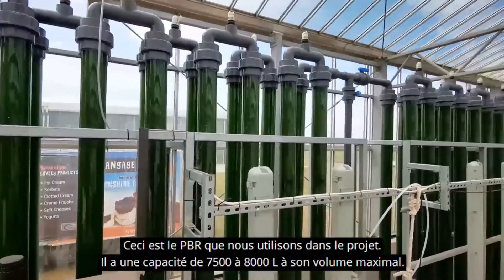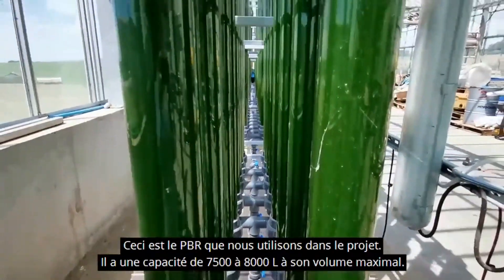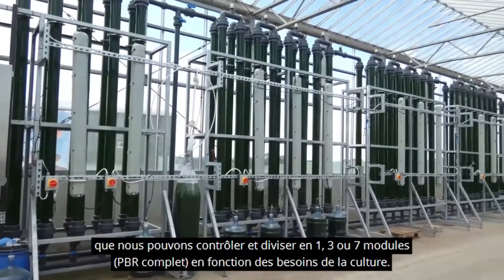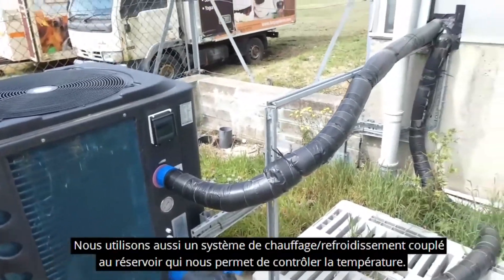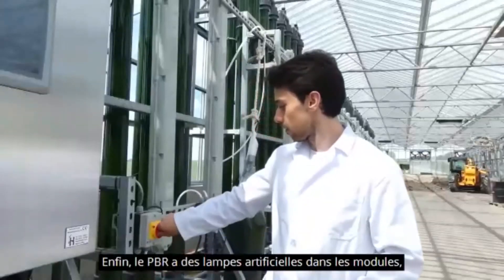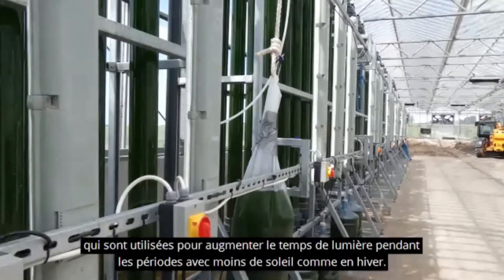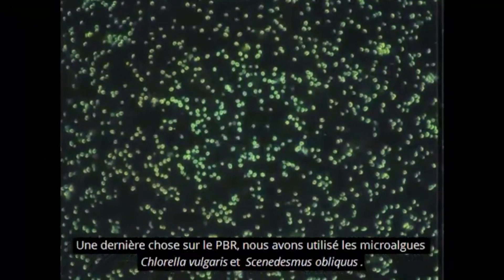This is the PBR we use in the project. It has a capacity of 7500 litres to 8000 litres at its maximum volume. It consists of a dark tank and 7 modules, which we can control and divide into 1, 3, or 7 modules — considered full PBR — depending on the needs of the culture. We also have a heating-cooling system coupled with the tank to control the temperature. Finally, the PBR has artificial light installed in the modules, used to increase the hours of light at times of less sunlight such as winter. We have used the microalgae Chlorella vulgaris and Scenedesmus obliquus.